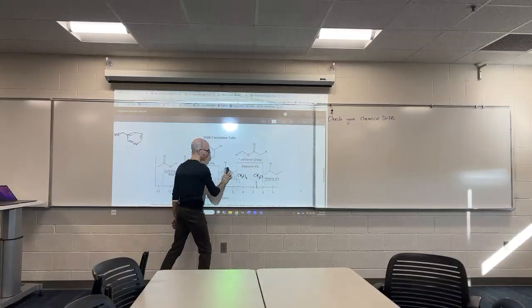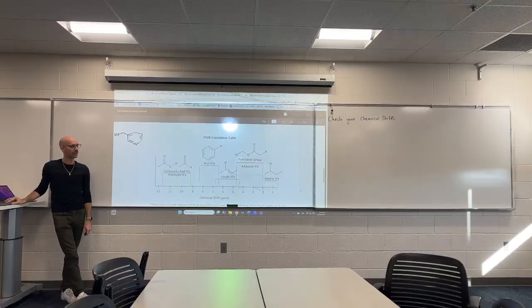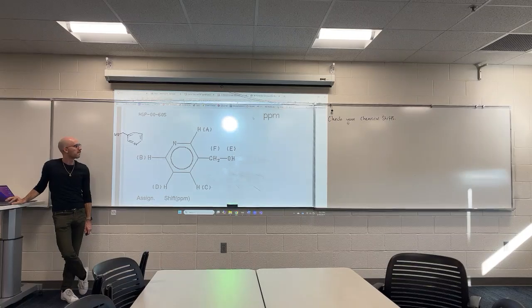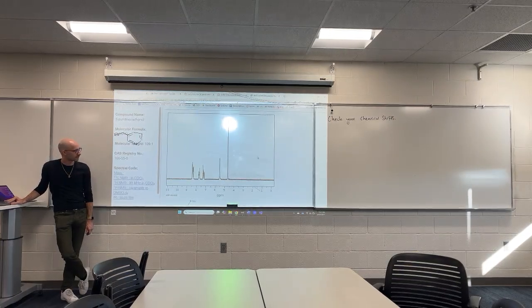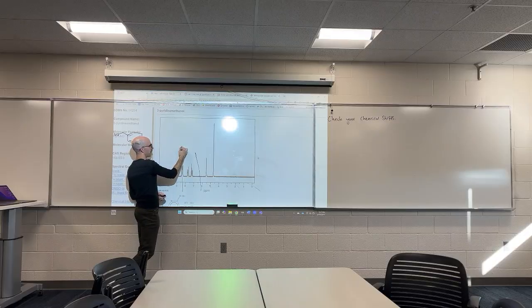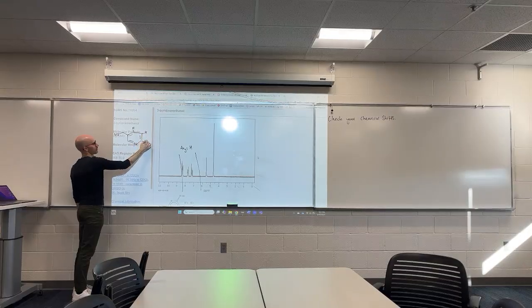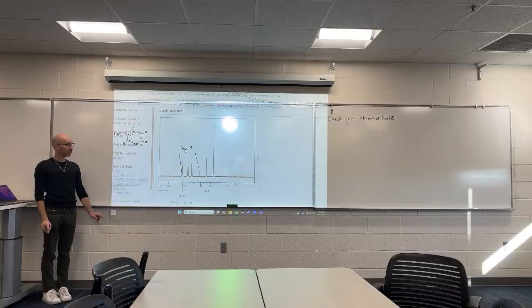So let's check it, shall we? And Kira, you gave this to me because you felt like it did align with the correlation table, or just because you liked it? All right, so let's see how it looks. I've got signals from 6.5 to 8.5. Those must be my aryl hydrogens. That's this, this, this, this. Good. I expected those to be in that range, and I found signals there.